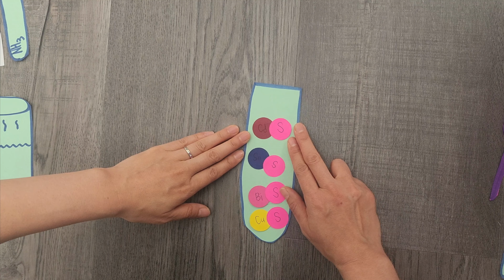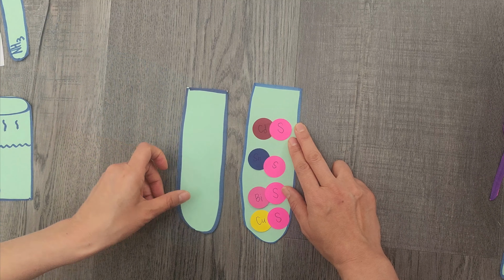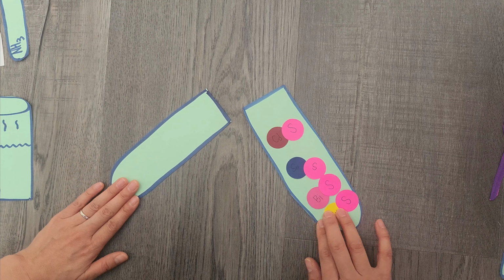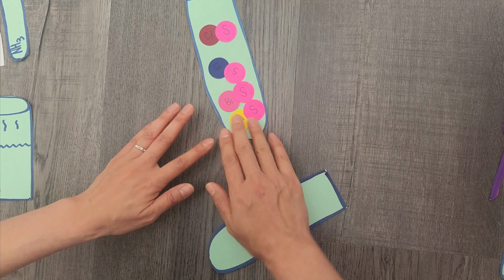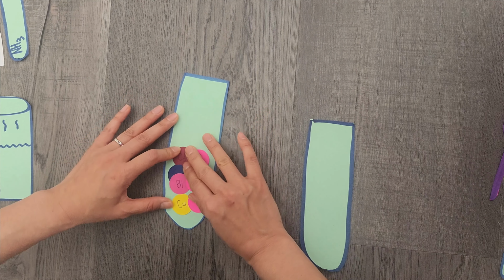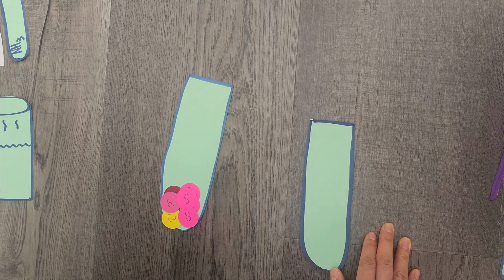Now you're going to go ahead and take this, get another test tube, make sure it's measured up with water, so that you can centrifuge, right? Centrifuge requires it to spin down, and all of this precipitate will start to kind of clump up towards the bottom, and you'll be left with the supernatant.